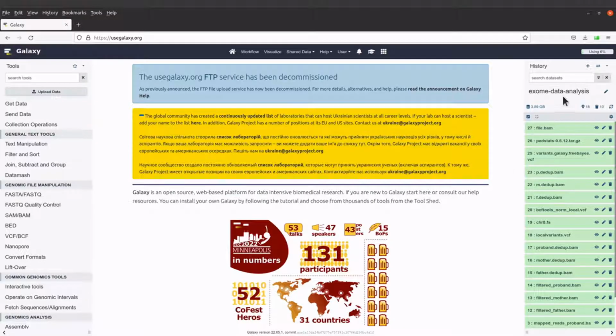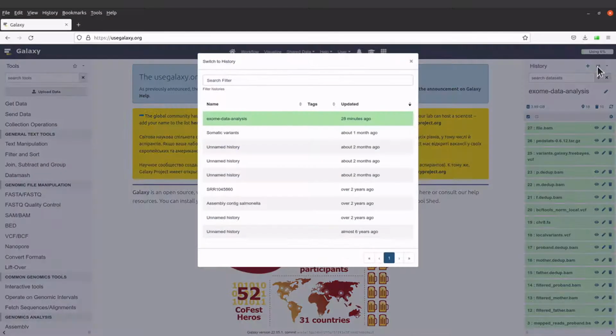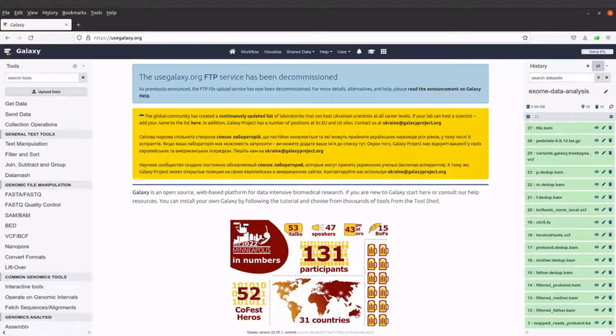I have performed some analysis, and so this is the most recent history. If I come to this side, I can click, and then Galaxy will show me all the activities I have performed. Some of them I performed over 2 years ago, some of them about a month ago, and some of them I just worked on. So that's the history. If you have used Galaxy before, then you have this there. So that's about it. Now let's switch back to the other account.